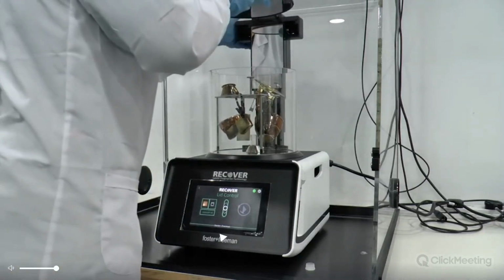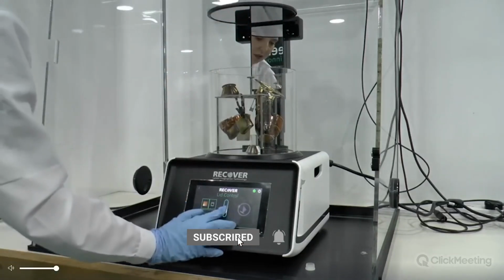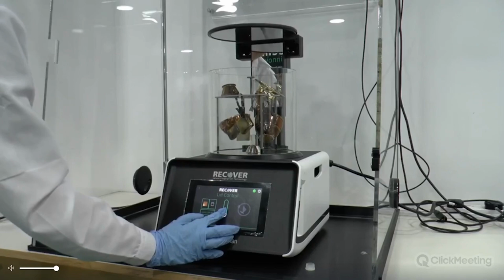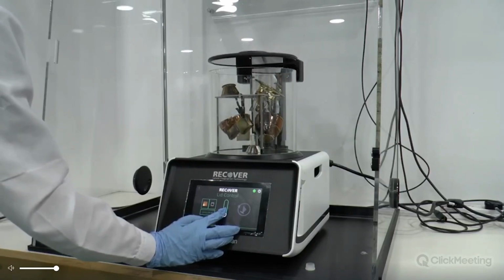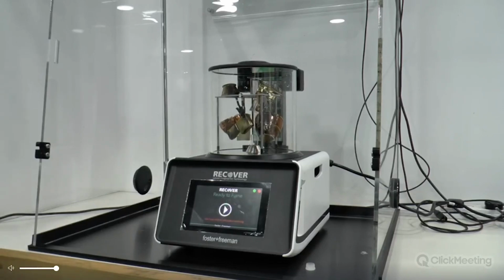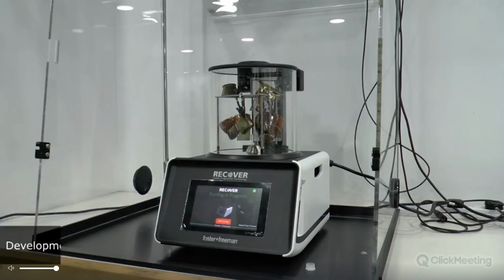So now we will put the lid onto the column, and using the lid control, we will bring it down on top of the chamber. We'll then press start. Now the instrument is ready to fume, so we simply press the go button.